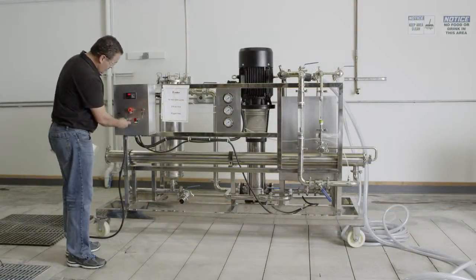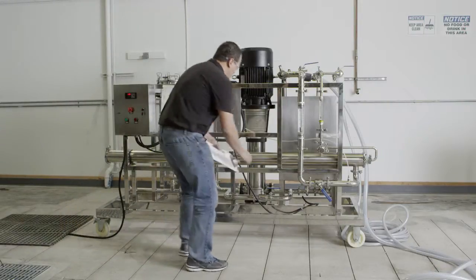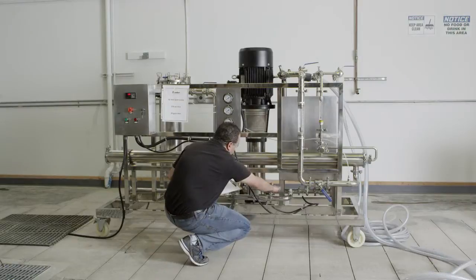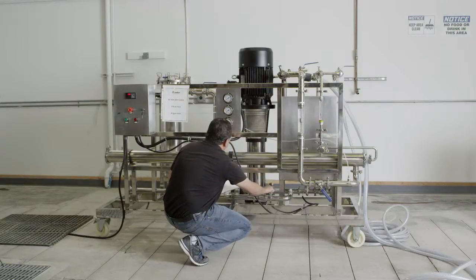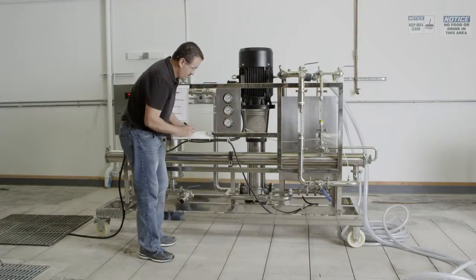Now you are ready to restart the system and adjust the pump, recycle, concentrate pressure and flow rates. Refer to your operating manual or consult with Cinder Filtration's technical support team if necessary. After running for about 15 minutes, readjust the valves if needed.